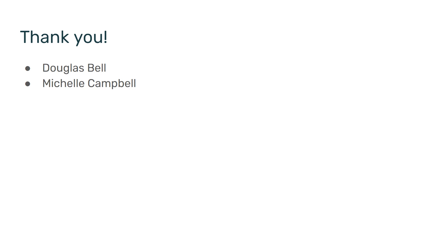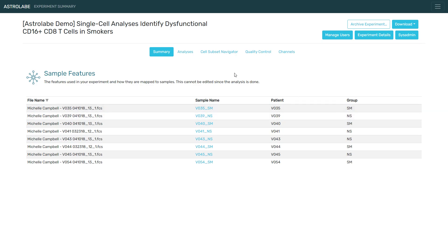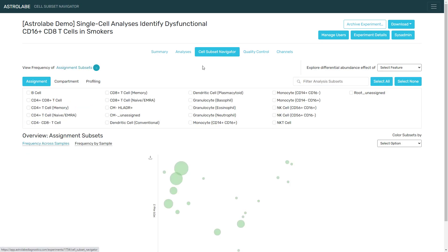I'm going to show you a brief re-analysis of the data using Astrolabe. Before I do, I would like to thank Doug Bell and Michelle Campbell for sharing the data. Here is how the experiment looks like in Astrolabe. We have the FCS files and the two patient groups. Smokers are SM, non-smokers are NS, and I'm going to start by going to the cell subset navigator.